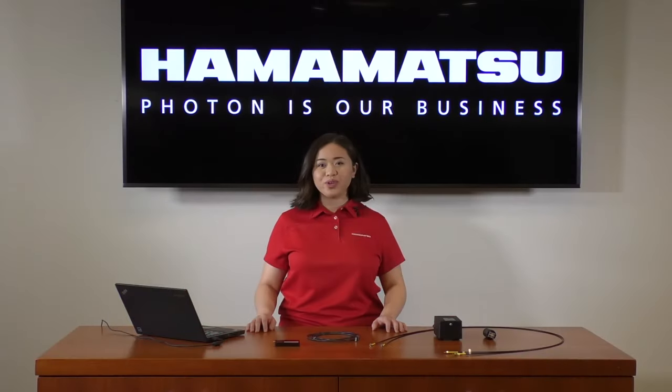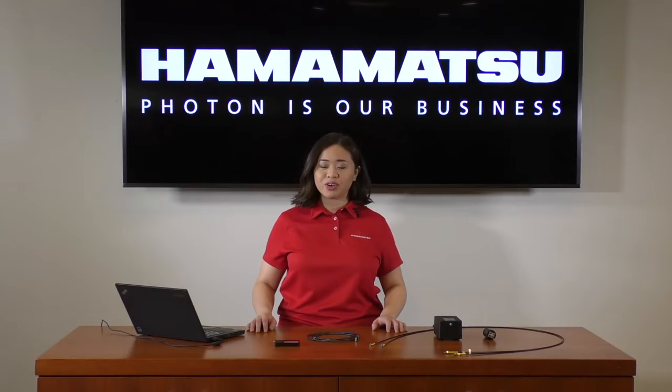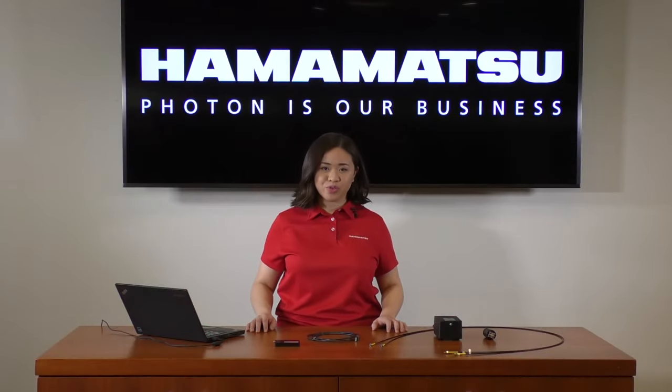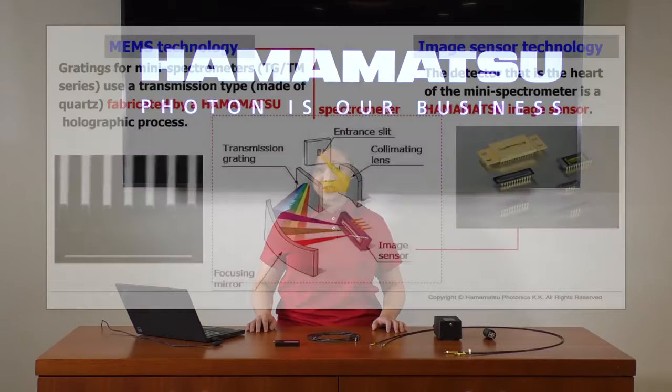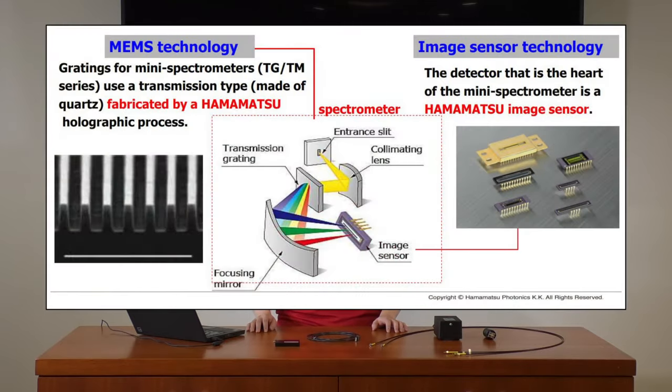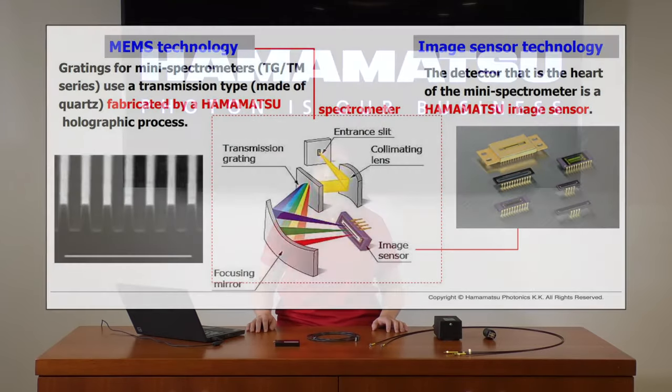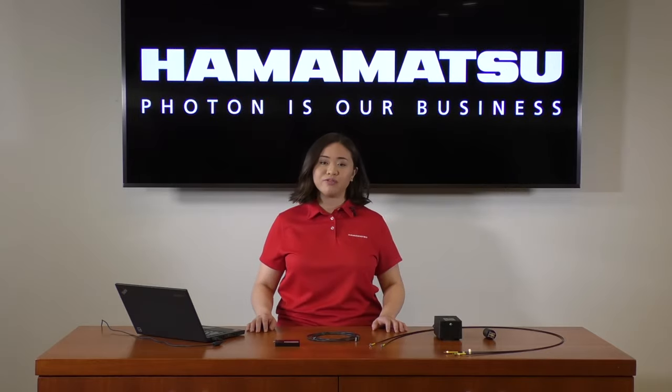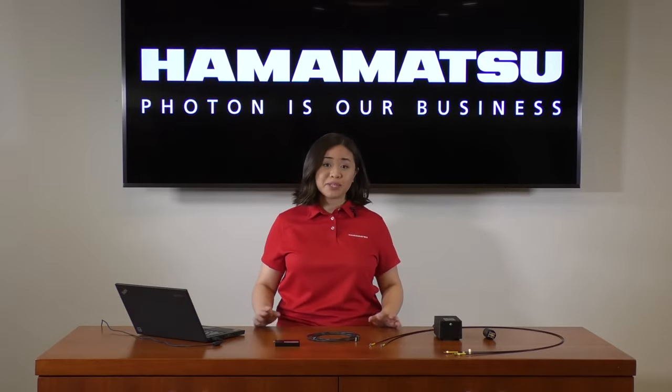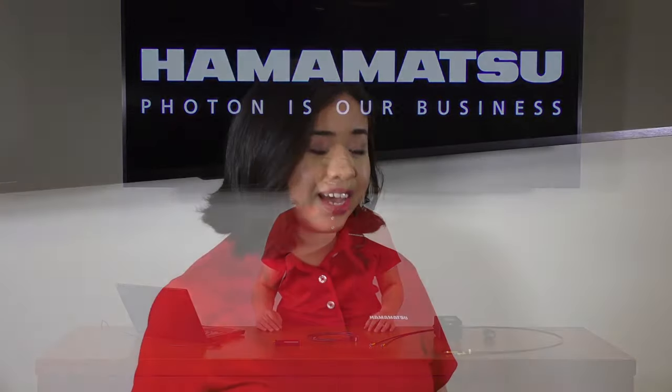We manufacture our own high-throughput transmission gratings, so every transmission grating and image sensor that goes into each spectrometer is manufactured, put together, and inspected to be sure that it receives our seal of approval.